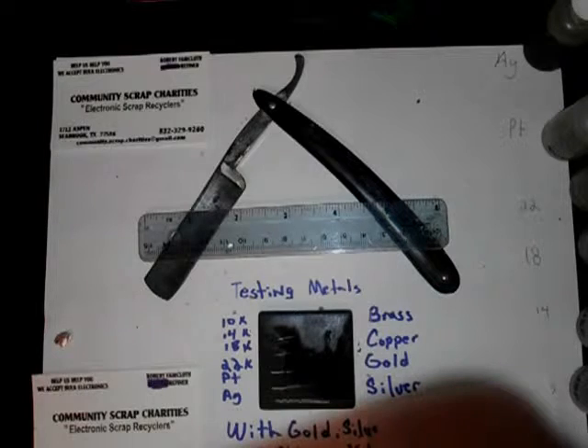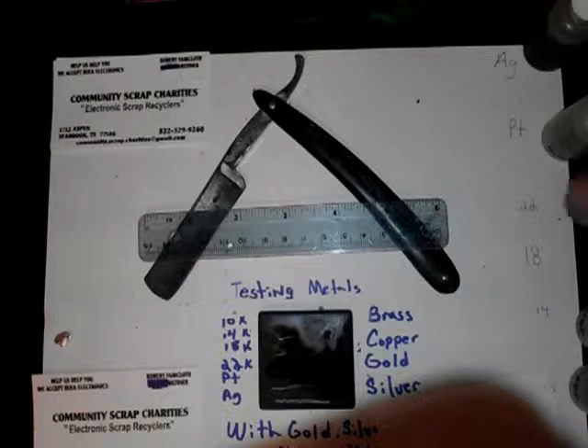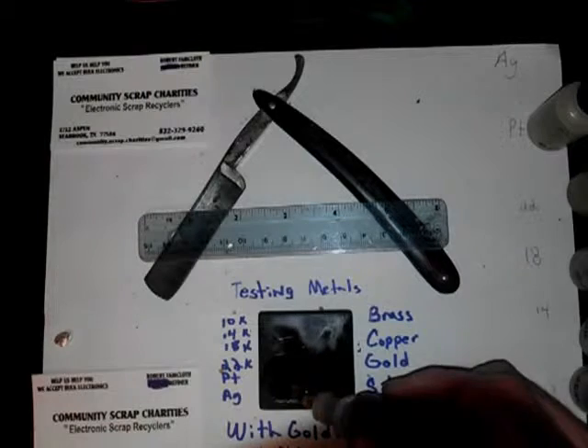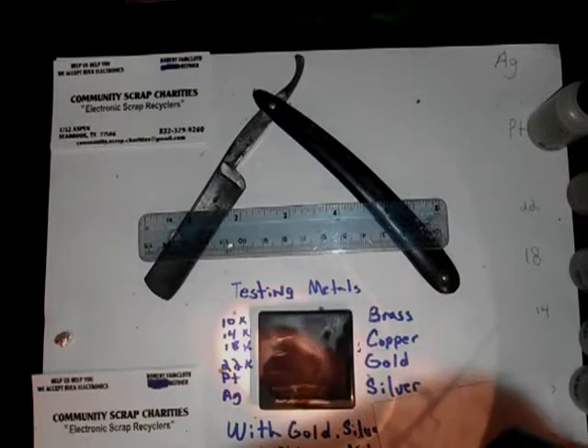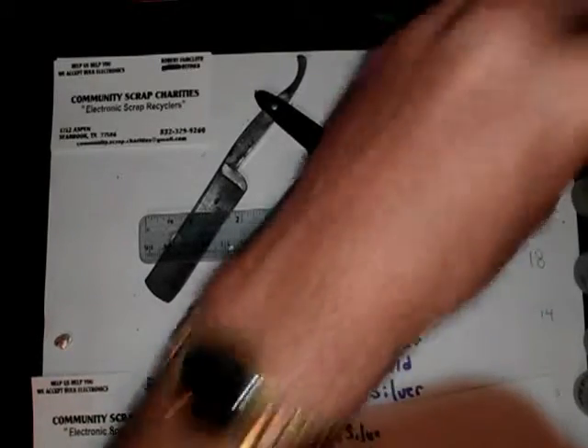Alright, that was 18. 22 — 22 definitely eats it away, you can tell the difference. There's some platinum. The platinum really doesn't mess with it much. Sometimes it's pretty important. Silver — you can see silver will turn a funky color. Looks like it might be silver right there. But as you can tell, you can see what works and what doesn't and what it looks like.